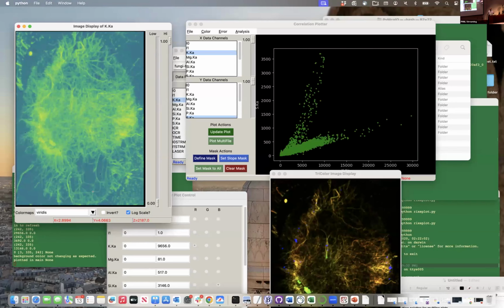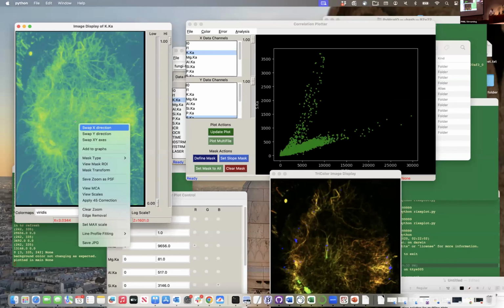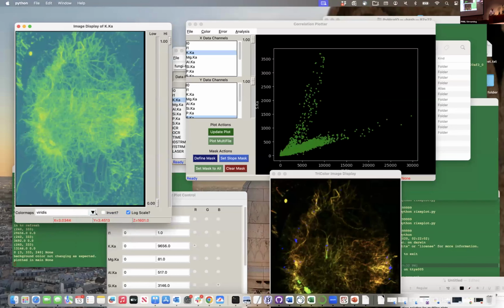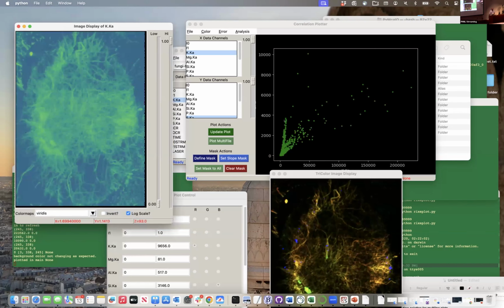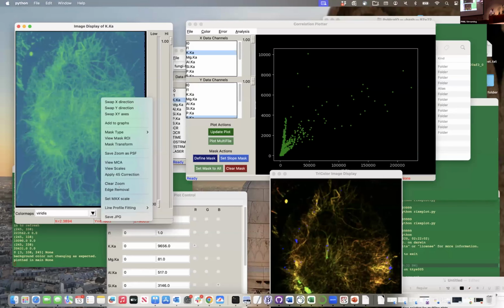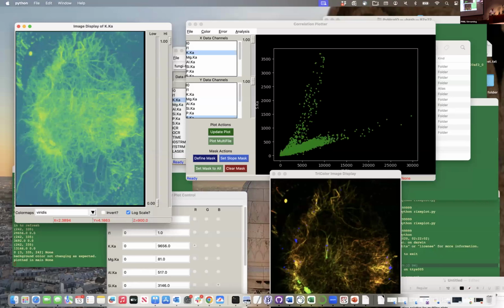And you can also see that there's that little weird edge correlation. Go back to that. You'll see this with a lot of our XRF data. There are these pixels here, which look really strange, and that's our edge data again. So if we remove that, that part goes away. That's that one, again, bad pixel on the left side.